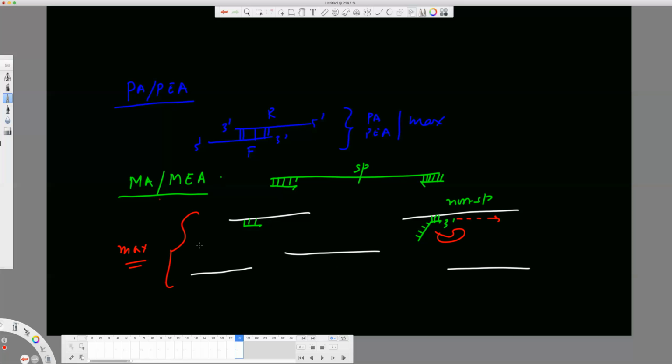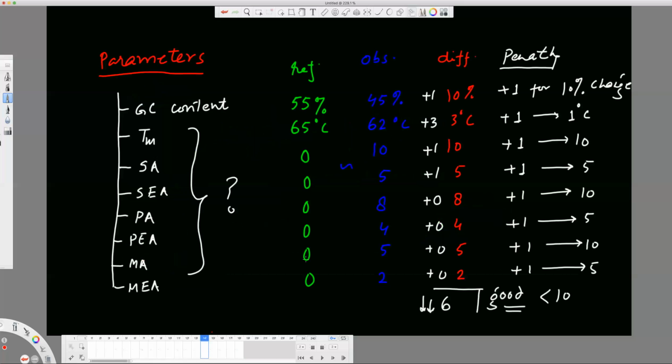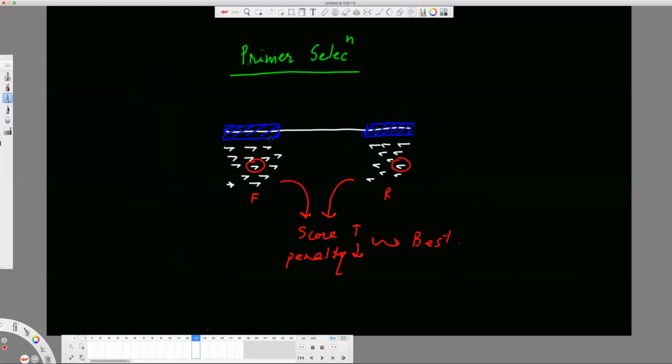All right, now when I mentioned this method, it might be fine if you have a limited region here to look for primers. Then you will have a limited number of forward and reverse primers, so the possible combinations of these primers would be rather limited. But there can still be a scenario where this scope is increased dramatically, for multiple different reasons.